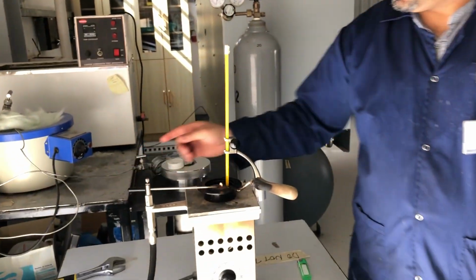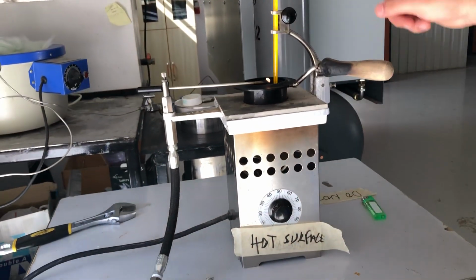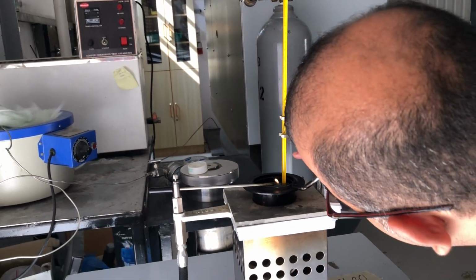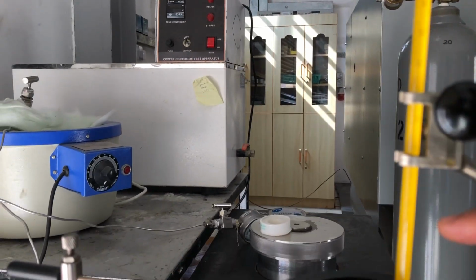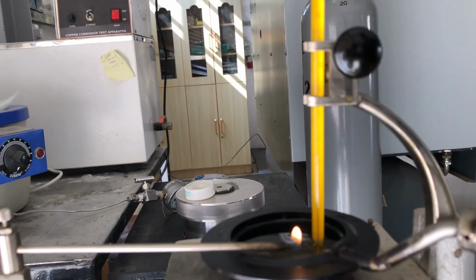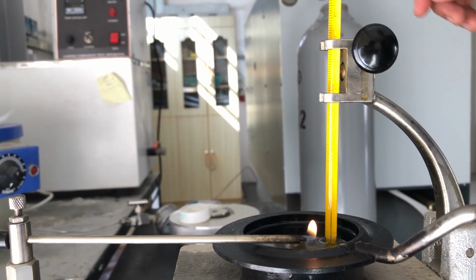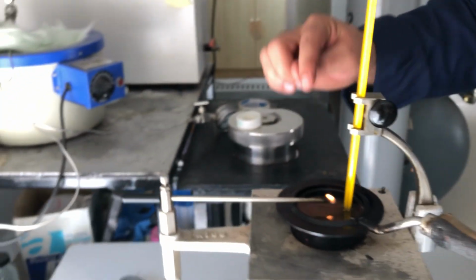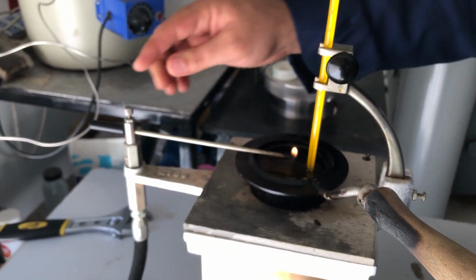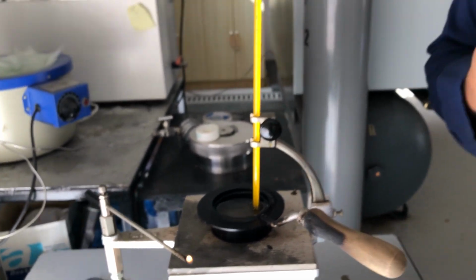Okay, so we already started the heater and we have to observe the temperature. Currently the temperature is 25 degrees centigrade or Celsius. This is the room temperature at which we start the experiment. We don't keep the flame at the surface because we don't want to heat it from the top. All the heat should be from the bottom for uniform heating, okay?